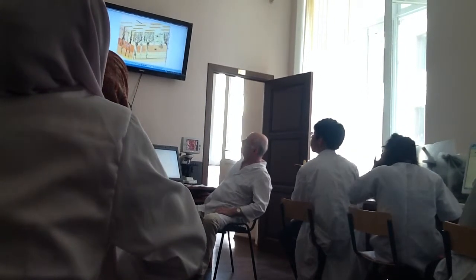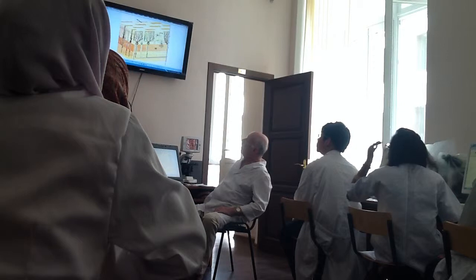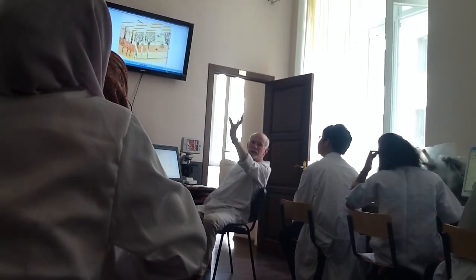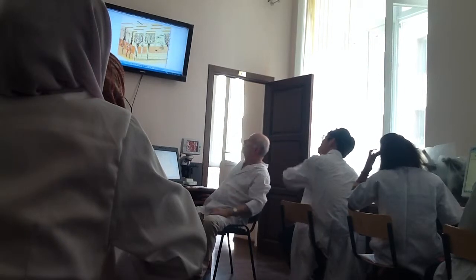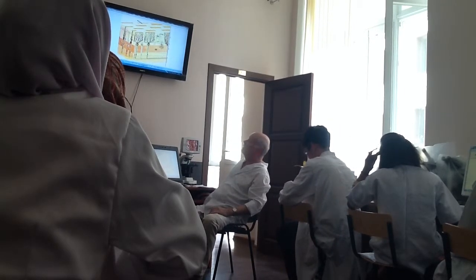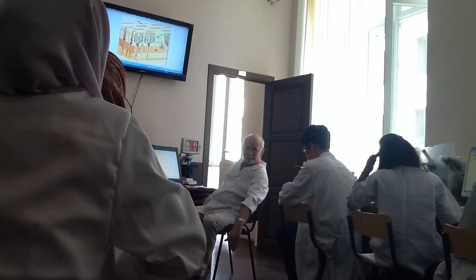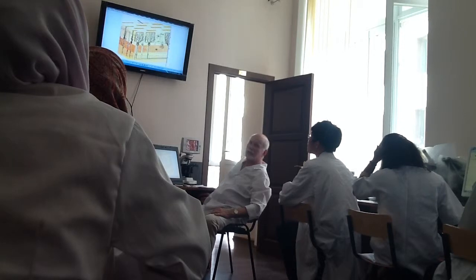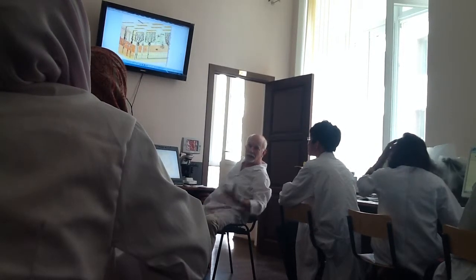Red fibers are afferent, bringing the impulses into the cerebellum. Black, the axons of Purkinje cells, are efferent, going out. The rest of the neurons are associative.